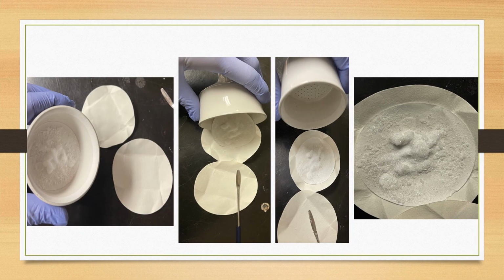The weighed filter papers include one small filter paper used inside the funnel and two large ones. Place the filter paper and crystals between two clean pieces of the large filter paper. Scrape off all the remaining alum from the funnel, and the right image is the crude alum.